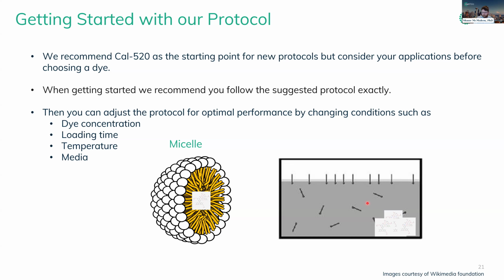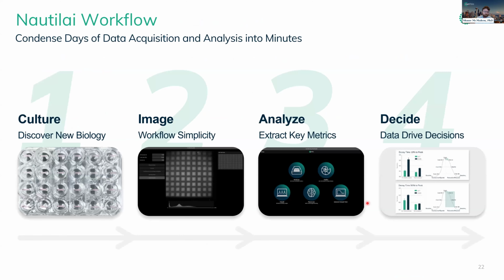Now that we have our starting protocol, let's consider the rest of the workflow. After loading, we can place the plate directly into the Nautilai for imaging, and then proceed with the automated analysis. And afterwards, we will make some decisions based on the data.